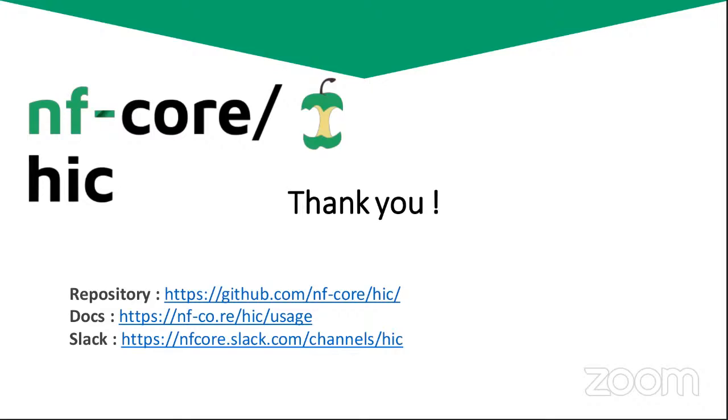This is Phil here. I was just thinking about, you were talking about the HiC protocols doing ChIP-seq on the HiC products. And then also saying at the end that you'd like to migrate to DSL2. I'm just wondering if there are any synergies between the existing ChIP-seq pipeline and whether we can share any of the underlying modules and maybe even sub-workflows there. Could you elaborate on what that type of analysis looks like?